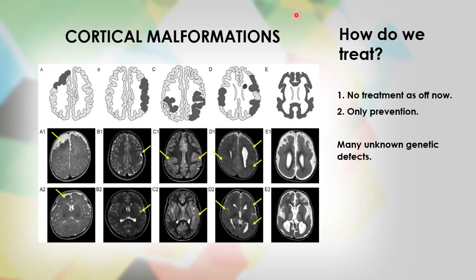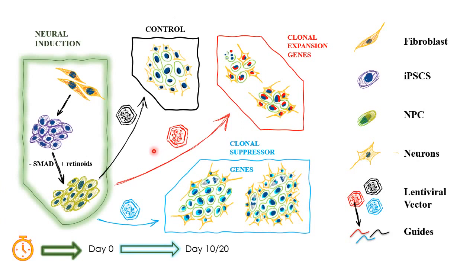development. This is not an easy task, but with emergence of in vitro systems for cortical development like iPSC-derived human neural progenitor and CRISPR technology, now we can conduct genome-wide CRISPR knockout screens to identify the regulating genes. Livesey Group conducted such screens on iPSC-derived human neural progenitor cells. This is how the screen works.